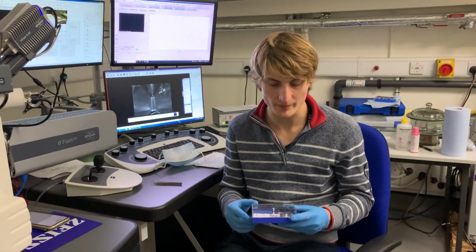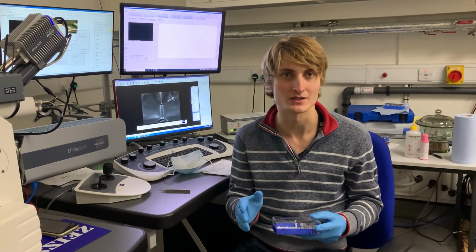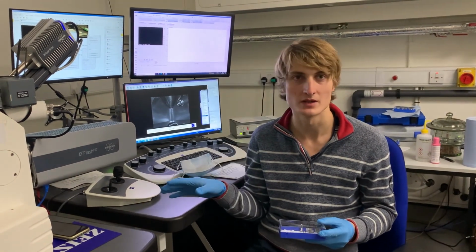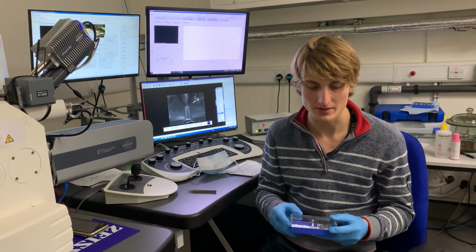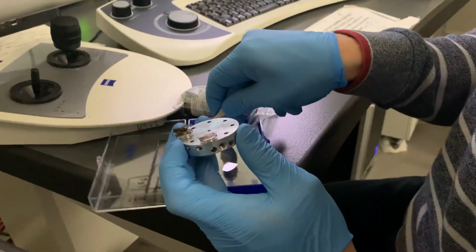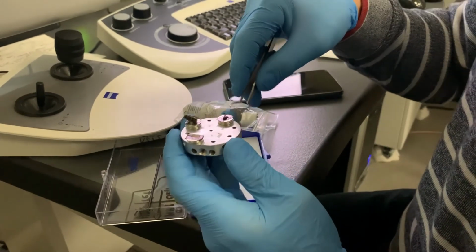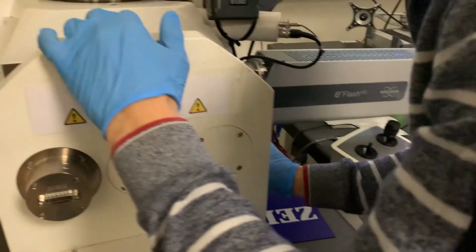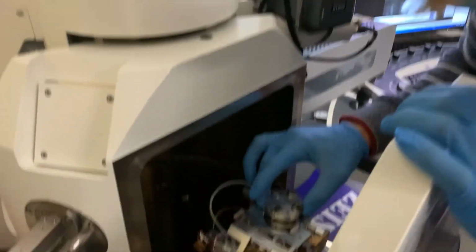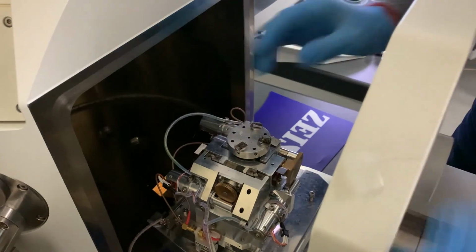We prepared our samples by coating them with gold, and now what we're going to do is mount them onto the sample holder and then put them in the SEM, and then we can see what they look like. Now all we need to do is place the holder into the SEM and evacuate the chamber. We can now move the view around and take images freely.